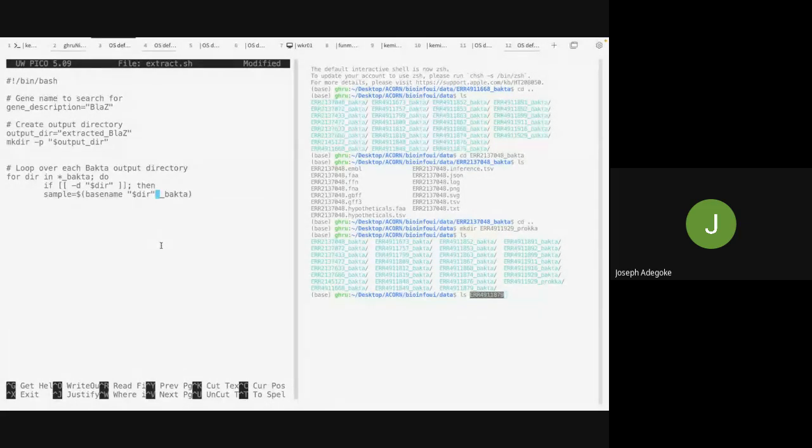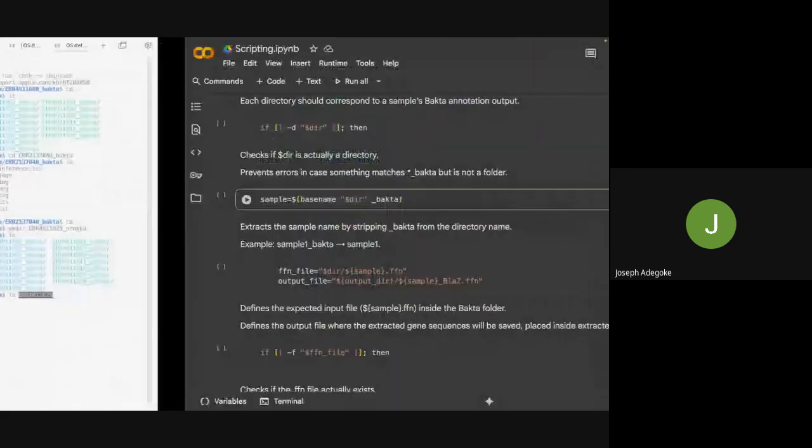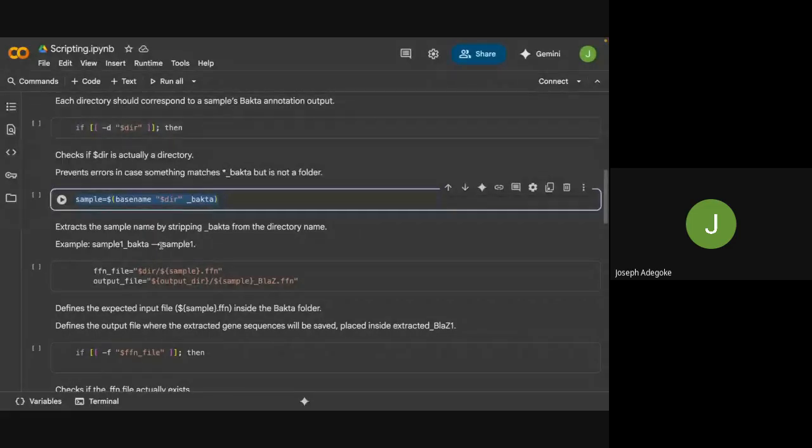These are minor bugs that may render your script not potent, and it will not work. You just keep running into errors. And if you are building a larger script and you made a mistake on that line, it's always frustrating because you won't even notice, you won't even expect something from that end.